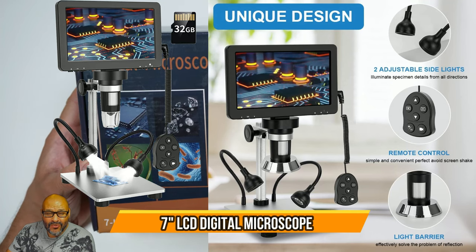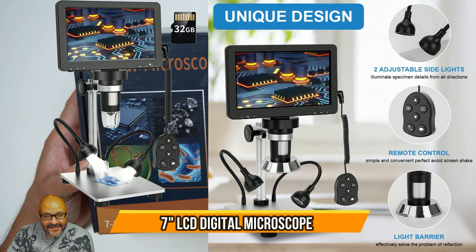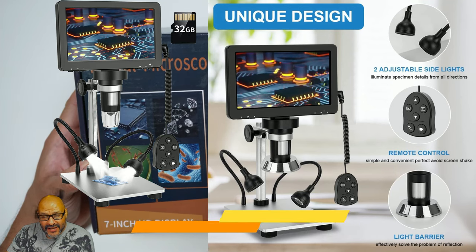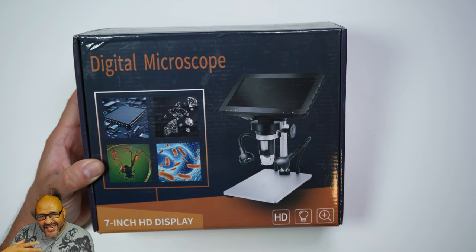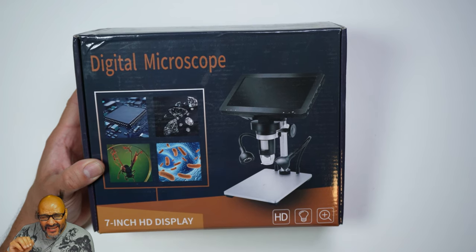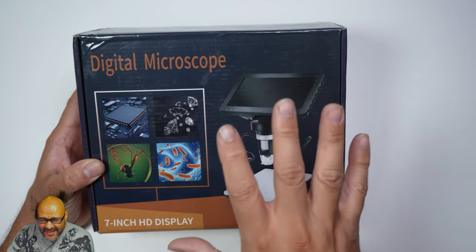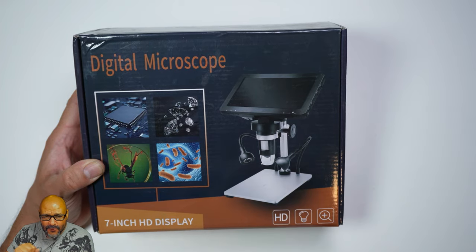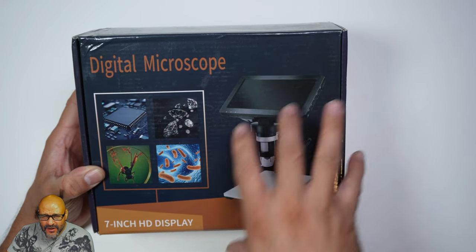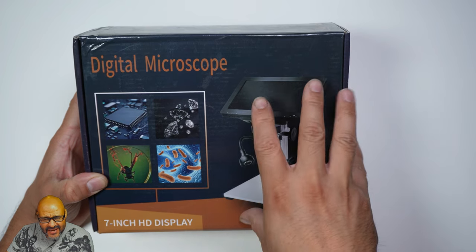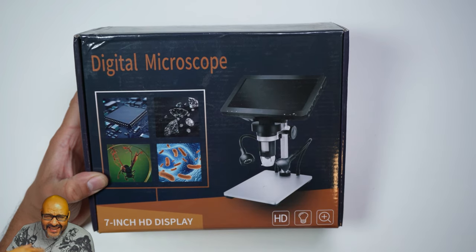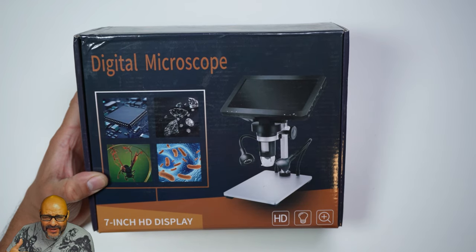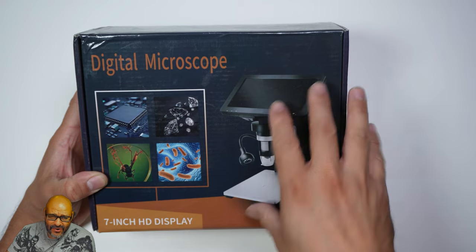Today we're going to bring a digital microscope. These are pretty good if you're a teacher, you want to teach a class and get down into the actual micro stuff. This is a great way to start. I actually donated one of these to a teacher that's been using this to get every student interacting with the system.